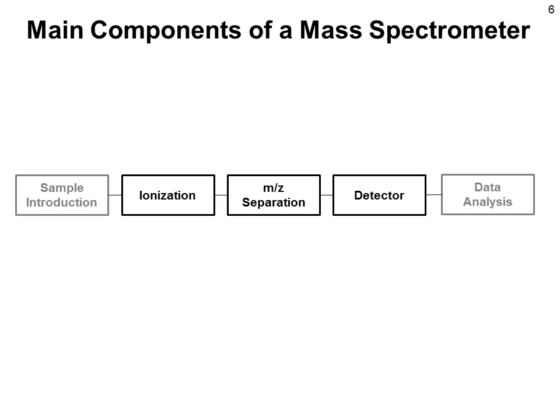Finally, again somewhat outside the actual mass spectrometer, is the data analysis part. That means the software, the computers that are needed to interpret the spectra and also to turn the mass spectrometry raw data into data that we can use to take decisions, such as in clinical chemistry looking at the concentration, for example, of a biomarker.